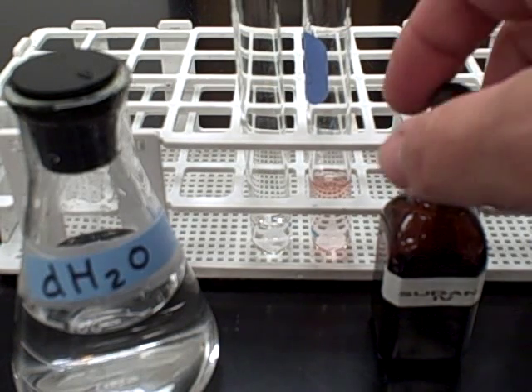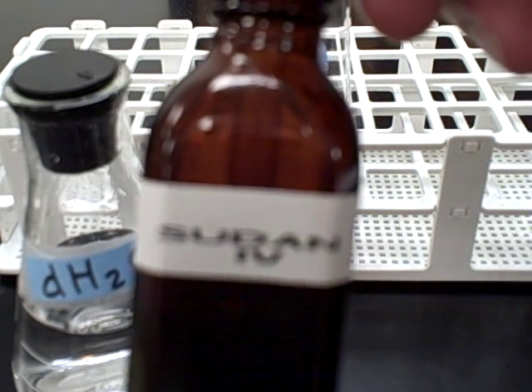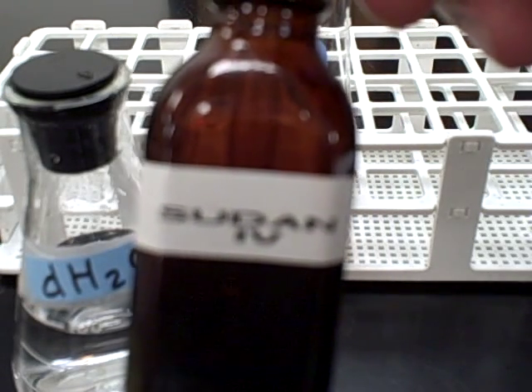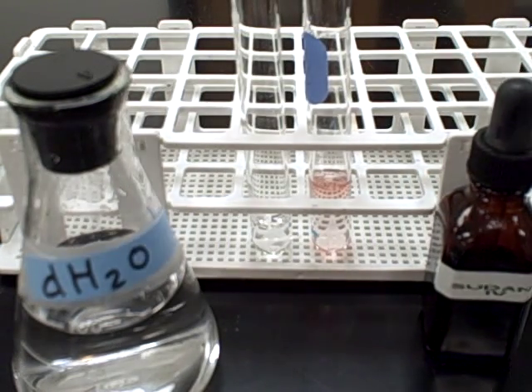This is the Sudan 4 experiment. Sudan 4 is used to test for lipids and oils, and we're using distilled water in our first one as our control.